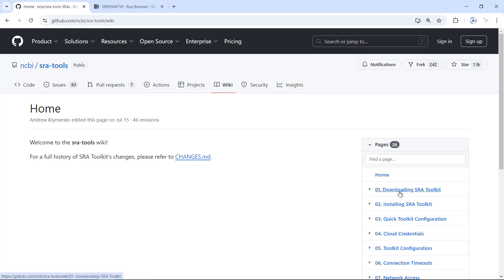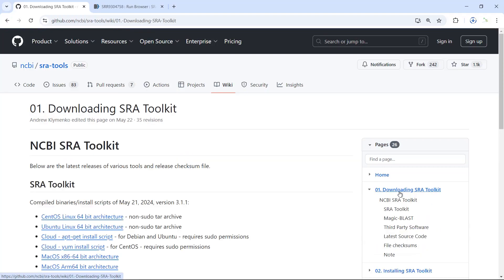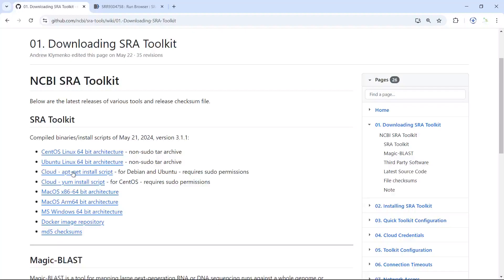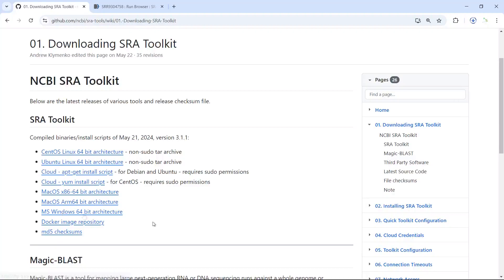The first link is for downloading the SRA toolkit. You can see there are links for different computer systems: Linux, Mac, and Windows. I'm using Windows, so I will download that one. You can use the link to download the toolkit for your system.